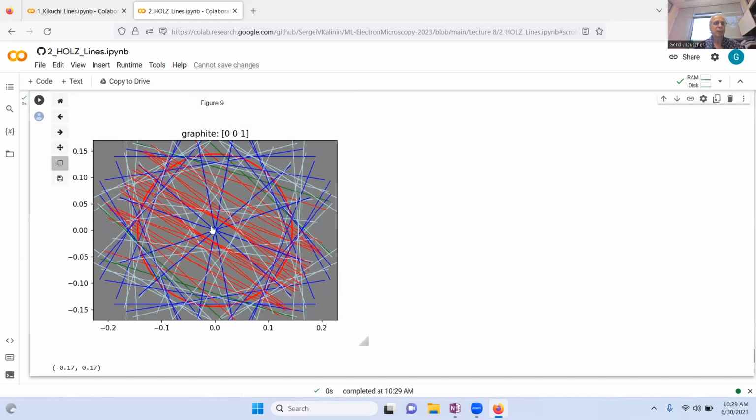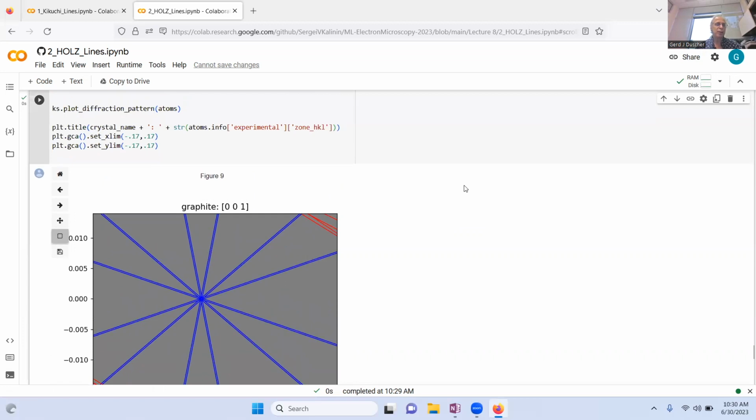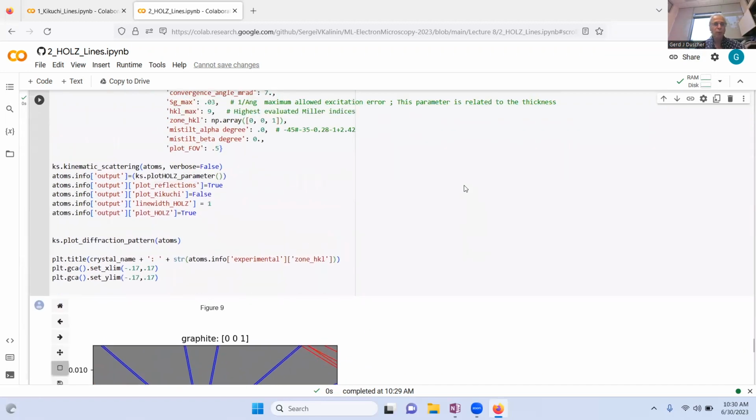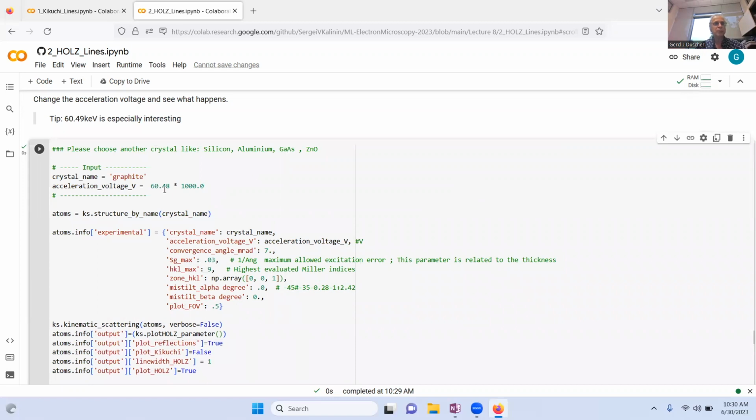And you will see that this is already changing your Kikuchi pattern. So a change of 10 volts in the acceleration voltage will already give you a different pattern, and you can monitor that. So this is totally, with the right conditions, observable. 100 eV is also possible.